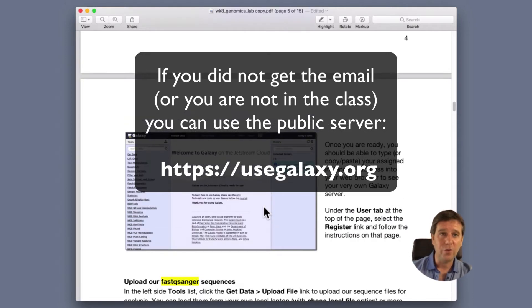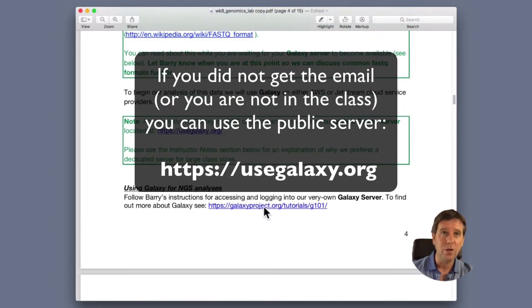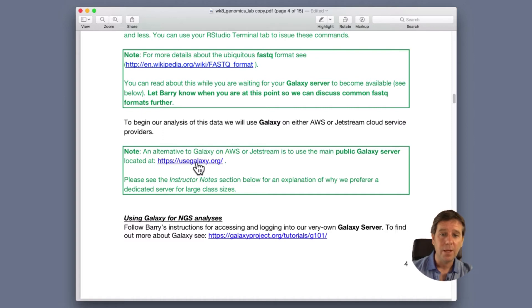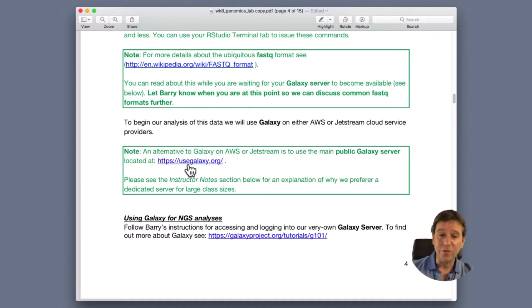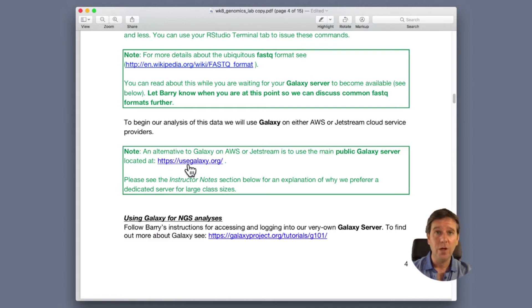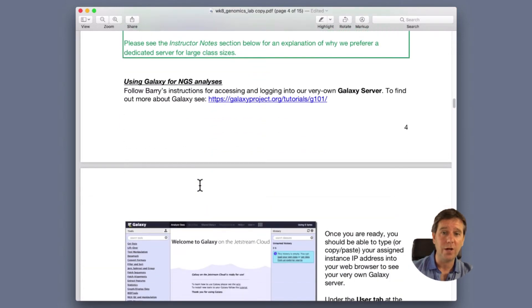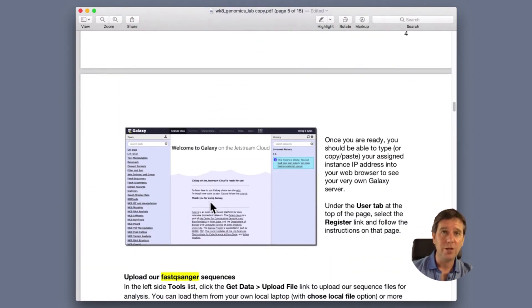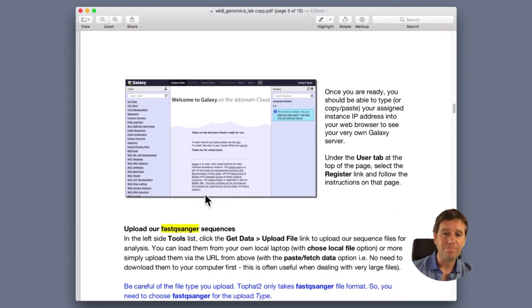I have sent each of you an email, automatically generated when I set up these servers. They're running on Amazon Web Services - Amazon is a major cloud provider, it's what Netflix runs on. I've started a brand new computer all set up and ready to run with Galaxy on it. If you're doing this later and don't have access to that server, there is a public web address called usegalaxy.org - that's a public server you can use. Unfortunately, if everyone in this class went to that website and started to do our work, it would grind to a halt - it wouldn't support all of us on this public server.